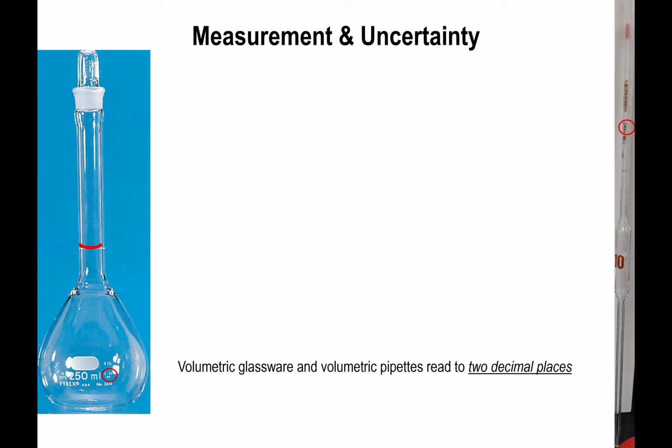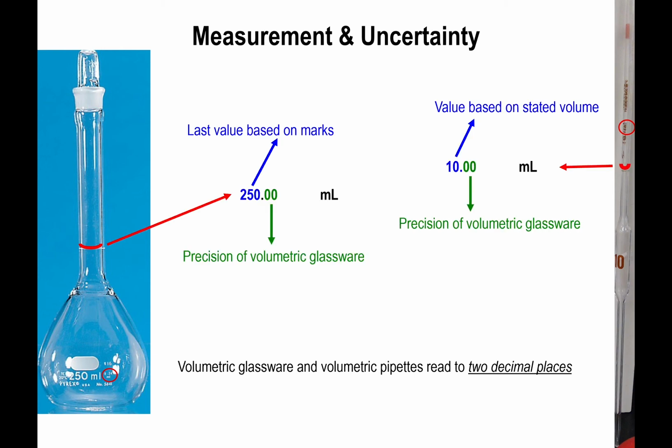What's the volume difference between the ticks? Another thing to point out is that volumetric flasks, like the one shown here on the left, or volumetric pipettes, like the one shown here on the right, are very precise volumetric equipment that we have in the laboratory, a lot more than graduated cylinders. So this particular value, here 250 mLs, is the volume of this flask, so long as you bring the liquid meniscus right above this line right here that you see, going horizontally, that white line.